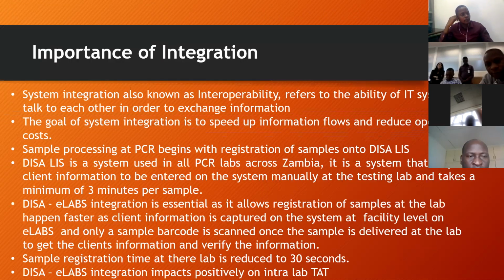So here we're going to look at the integration of eLABS with DISA and its importance. System integration, also known as interoperability, refers to the ability of IT systems to talk to each other in order to exchange information. The goal of system integration is to speed up information flows and reduce operational costs. Sample processing at PCR begins with registration of samples onto the DISA LIS. The DISA LIS is a system used in all PCR labs across Zambia, and it's a system that requires client information to be entered manually at the testing lab and takes a minimum of 3 minutes per sample.